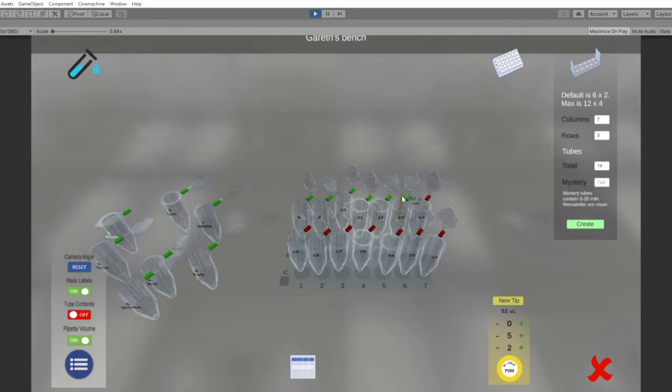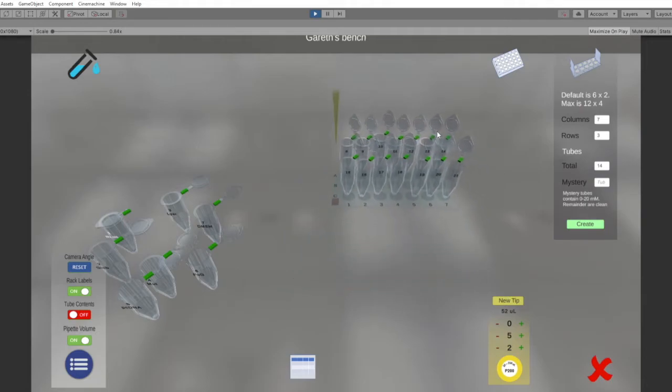So this is a nice thing about the simulator. We can mix either by pressing M when a tube is selected, or we can pipette up and down until the little tab goes green. There is an algorithm for that. I still haven't quite got that working perfectly. It should favor the higher volumes, of course. If you suck up and down a high volume, it should mix quicker.